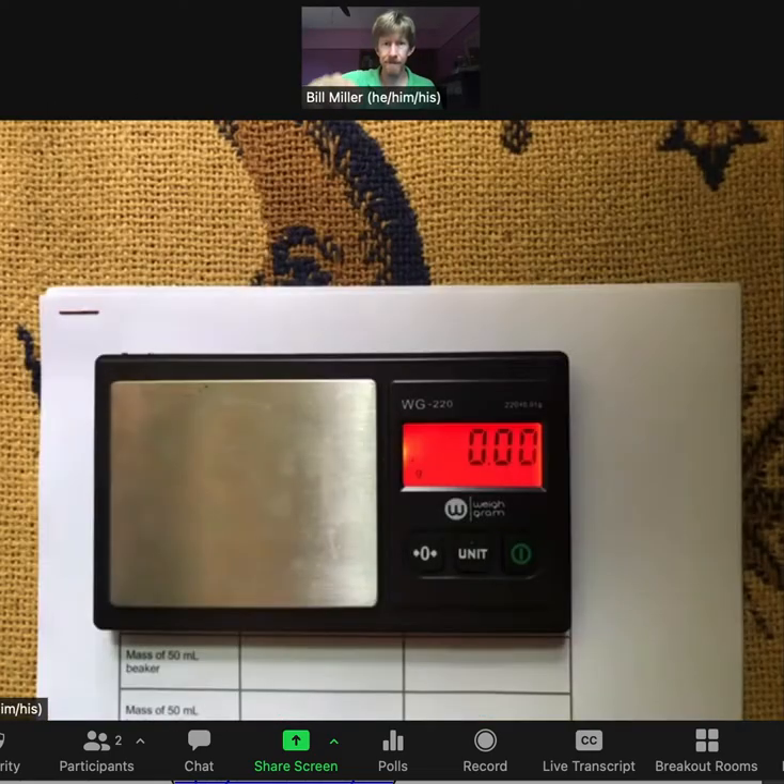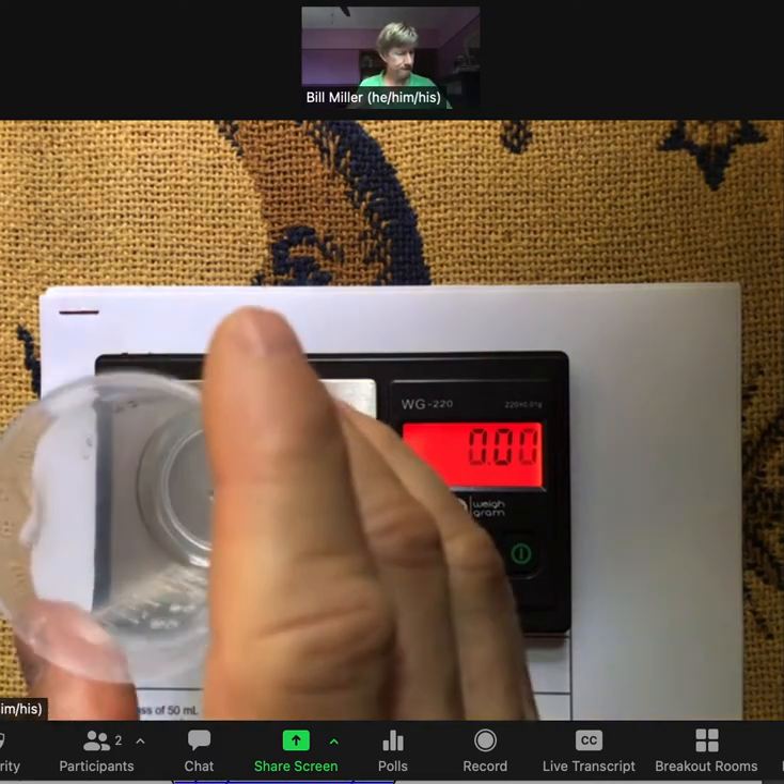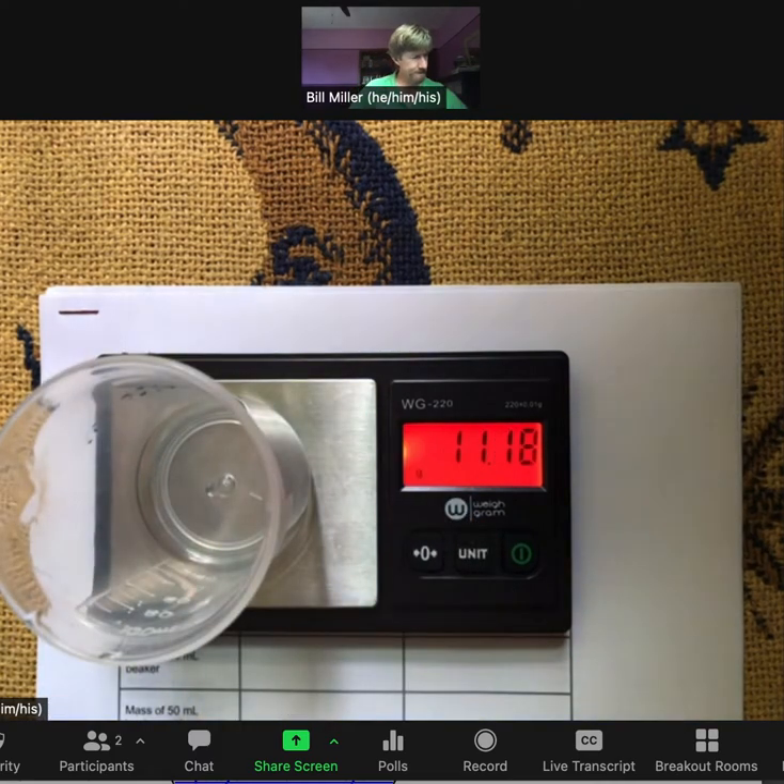Record the mass of the 50 milliliter beaker: 11.18 grams.